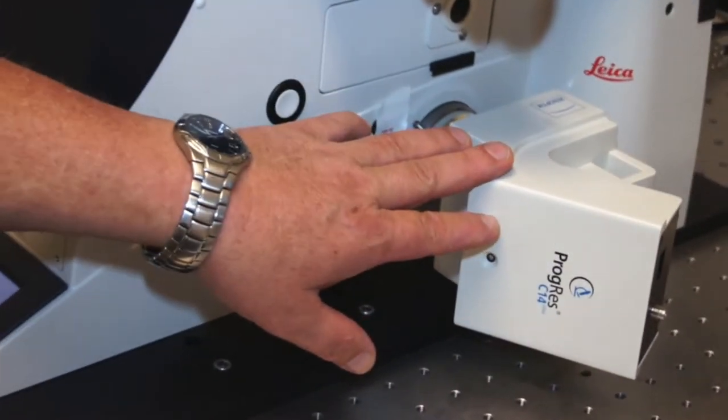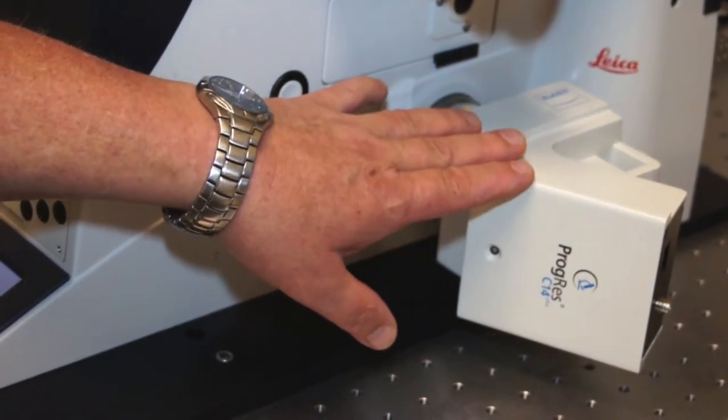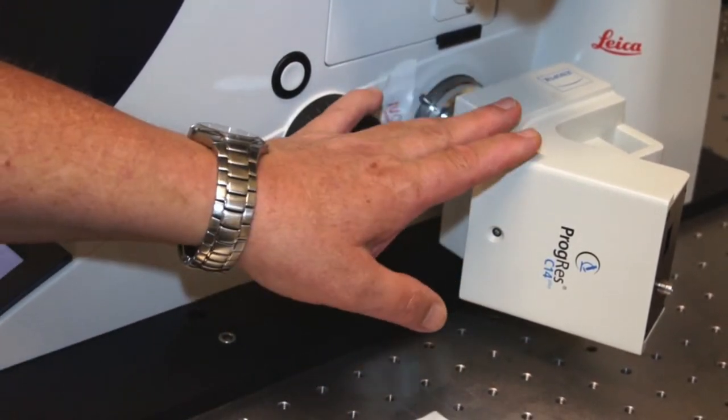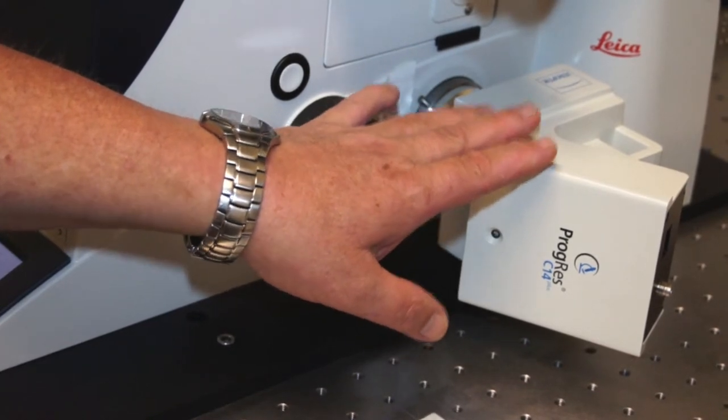As mentioned previously, we have an attachment digital camera hooked onto the camera port of the microscope, so we can take pictures right off the microscope if that's your desire.